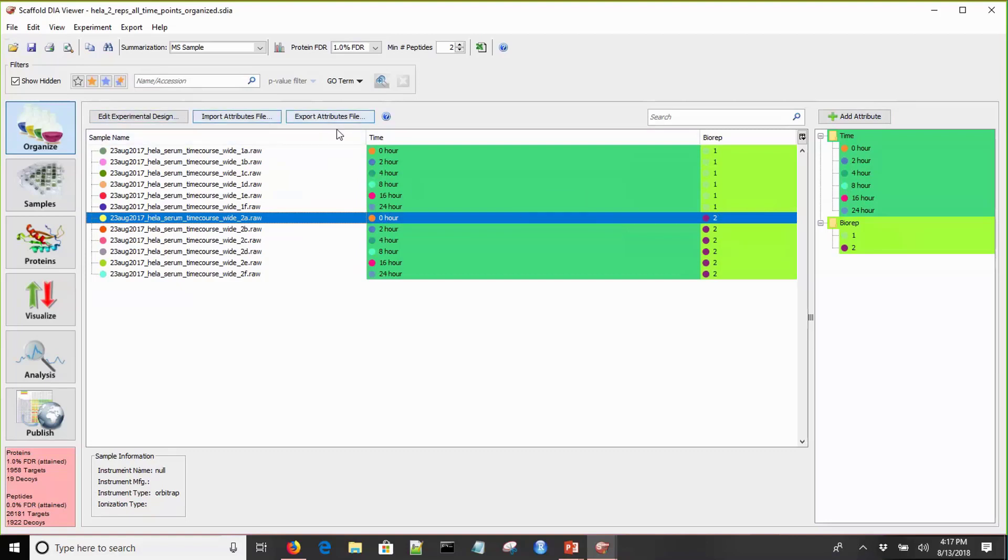I'm going to click on the import attributes file button, navigate to the attributes file that I've already saved, and click open. You'll see the attributes for all 12 samples were imported. Now we can see how our experiment is set up in Scaffold DIA. We have our biological replicates applied and all of our time points for all of our samples. For example, 1A and 2A, those are both the zero hour, tagged with the zero hour and their proper biological replicate.